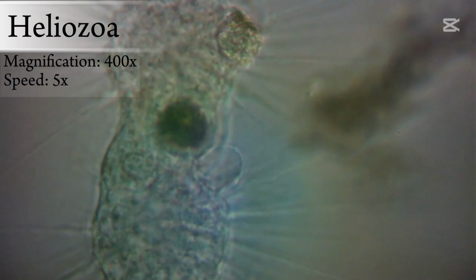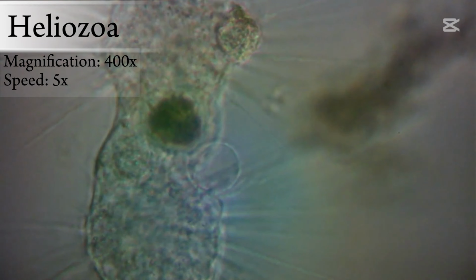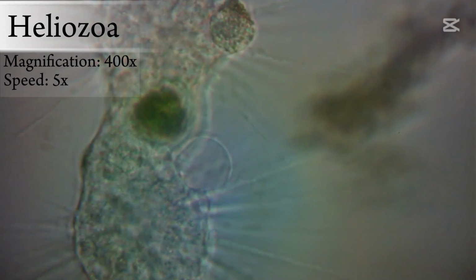It is a shame that I did not record any of the hunting show, but at least we can see it digests some sort of algae, probably. I hope I will soon find more of those bad boys, and that the opportunity of recording it catching its prey will come.